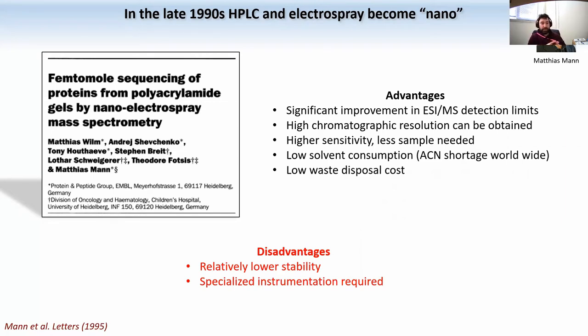The problem with spraying a sample into the mass spectrometer with a very high flow, let's say with liquid chromatography that flows in hundreds of microliters per minute, which is usually the flow rate you use, for example, when you do LC-UV, ultraviolet detection. The problem is that with a very high flow, it's difficult to generate efficient vaporization of your sample, and your samples are inevitably more diluted in a bigger volume compared to a small volume.